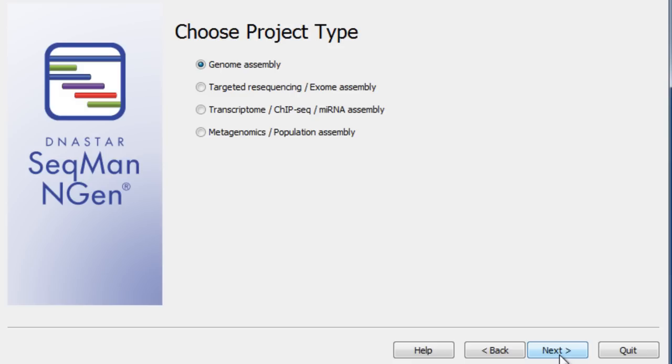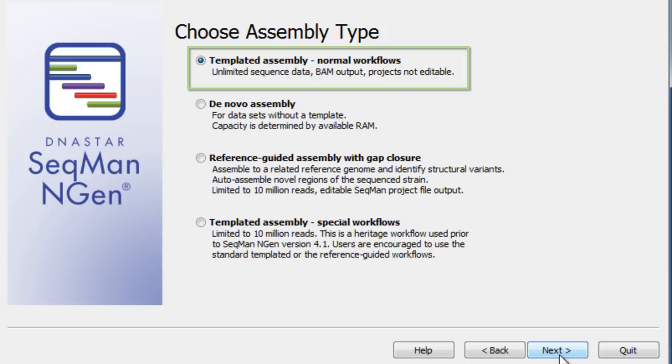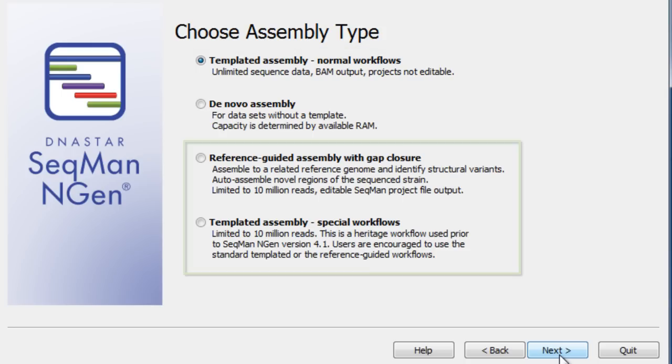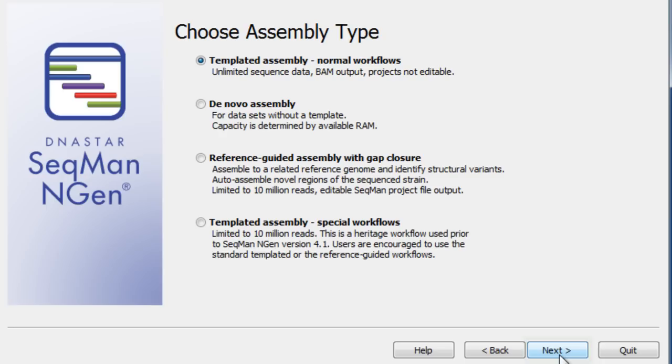To do a reference-guided genomic assembly, first set up your project by selecting Genome Assembly from the Project Type section, and then select Templated Assembly for Normal Workflows. For special projects, alternate workflows are available. Then, continue on through the wizard to specify the directories and sequence files you wish to use.